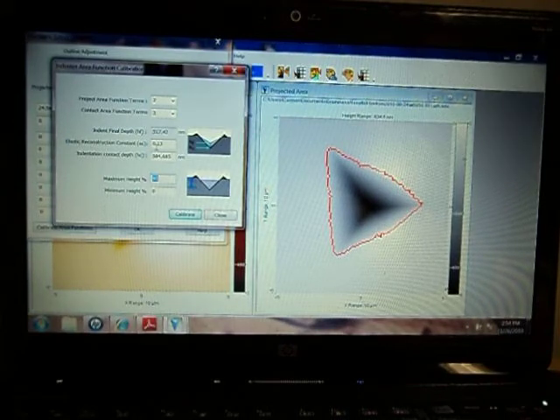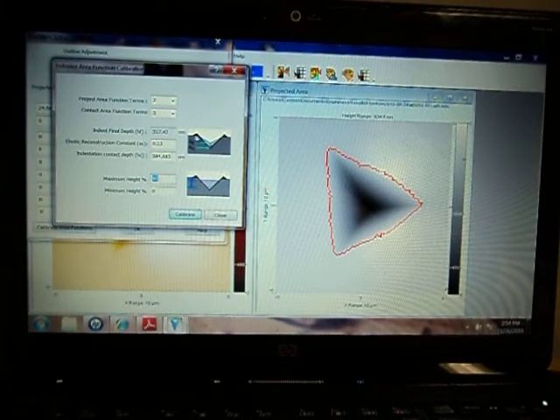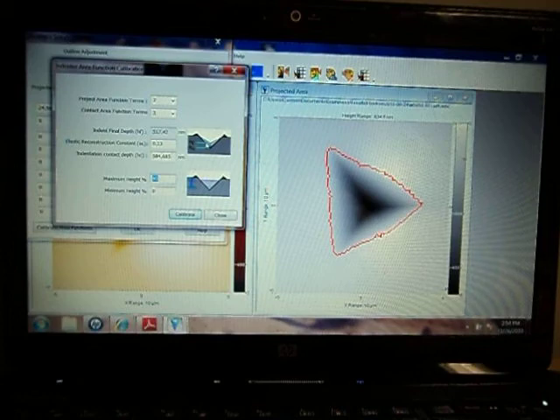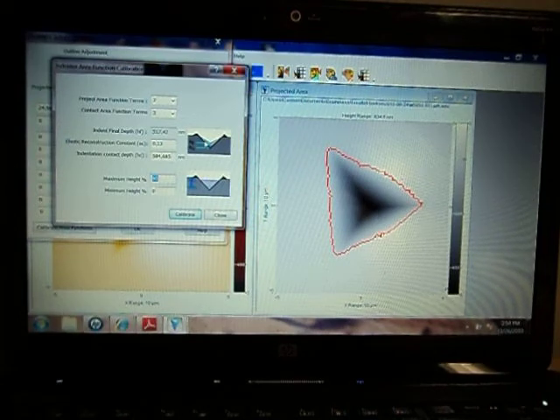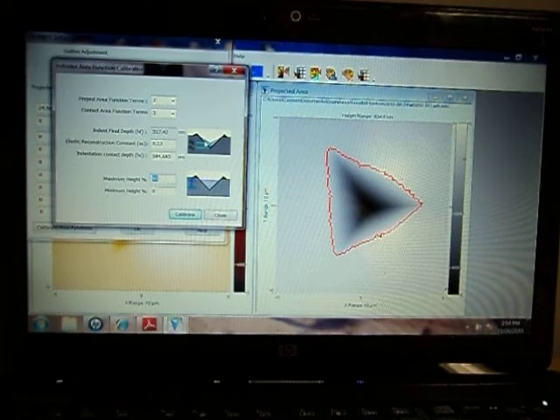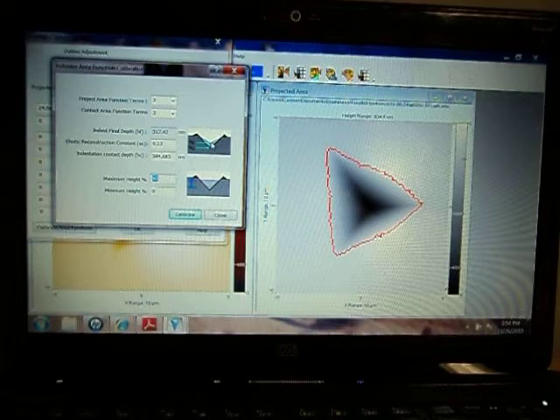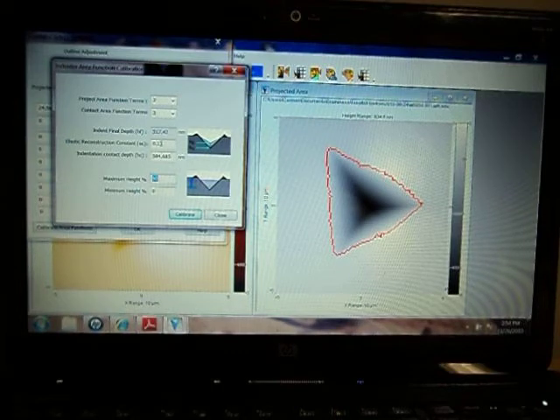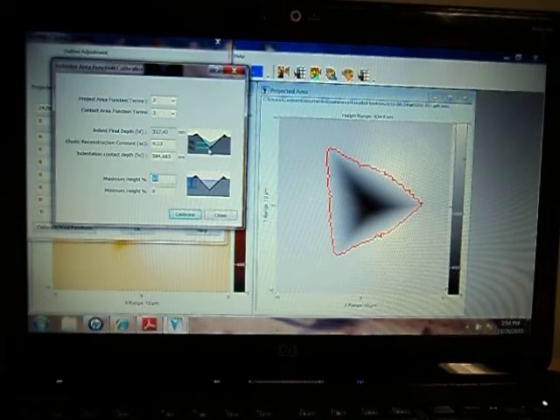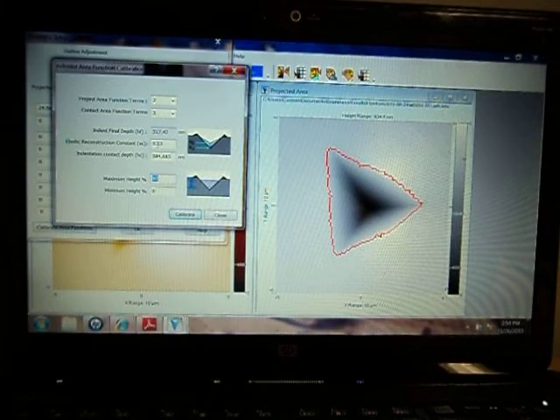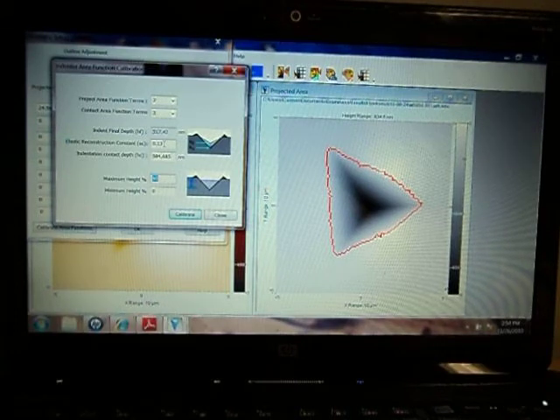The elastic reconstruction constant is used to create a new image of the indentation, where the depth of the pixels has been increased by a linear amount, 0.13 for aluminum.